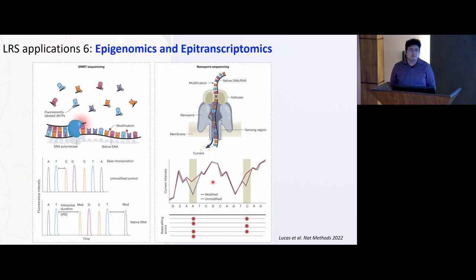Why is that? Now in Oxford Nanopore, it's quite clear that when there's a methylated base, there is a change in the current, so you get a different call. Correct. A call is very direct. Why is there a duration delay in PacBio with respect to methylation? So it's real time, right? We are seeing the DNA polymerase in action in real time. If the DNA that it is sequencing has a modified base, it takes slightly different time to take the next nucleotide and attach it. So by that change you can detect it. The key here is that it's happening in real time, so you can understand that kinetics.